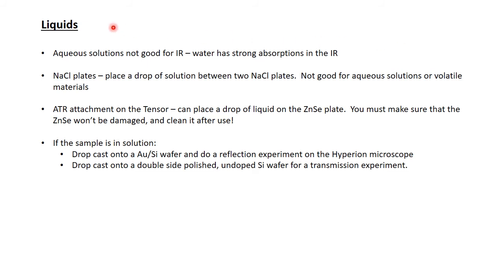If your sample is a liquid, we need to talk about a few things. The first thing is that aqueous solutions are not very good for infrared spectroscopy. And the reason for this is that water absorbs strongly in the infrared. So, if your sample is actually something that's dissolved in water, maybe we can just drop cast it onto a substrate that's more appropriate. We'll talk about that in a minute.